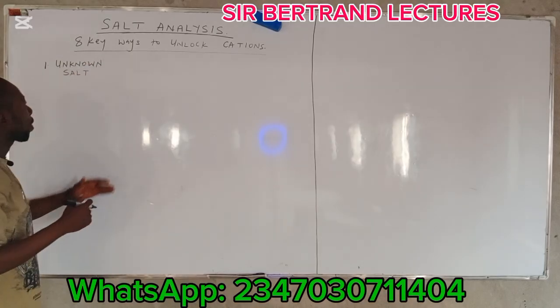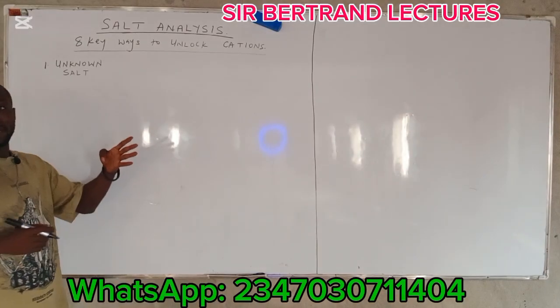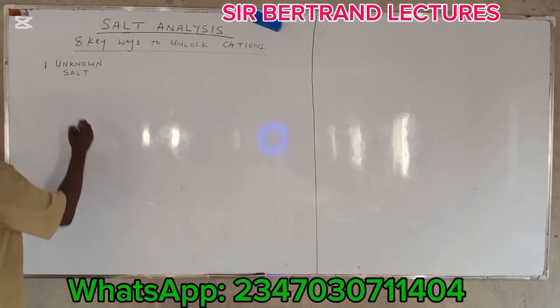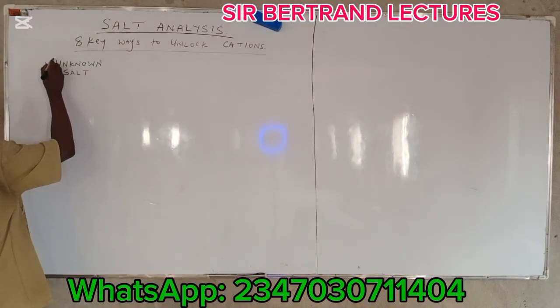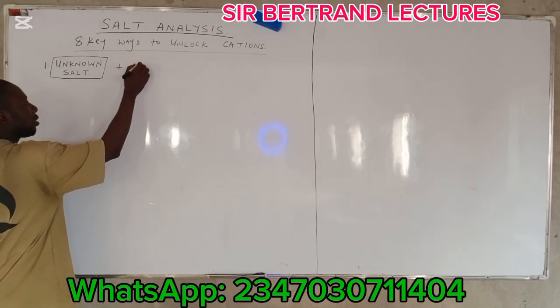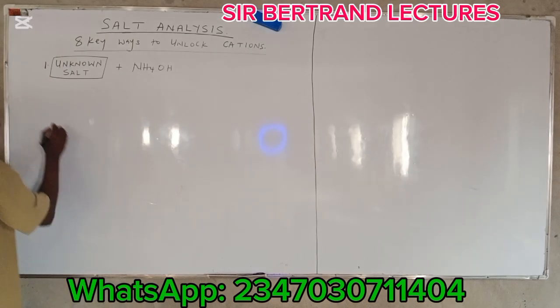All right. We have about 4 experiments where we add ammonium hydroxide. Here is the salt sample that is unknown. You add ammonium hydroxide.